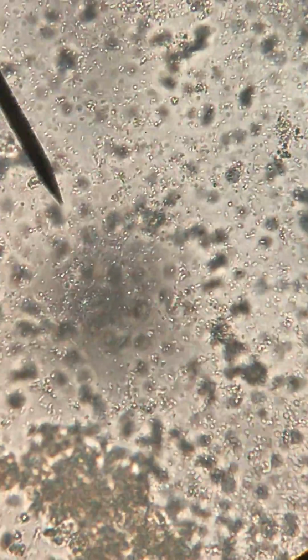Right, so how many of you, when you look at your spoon, if you've eaten yogurt, actually see this? No, of course not. Of course you don't. So again, a microscope is a tool that is going to enhance one of our senses, which is our sense of sight, and help us make better observations so that we can collect better data and do more research.